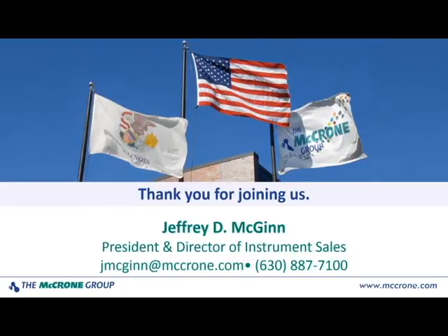From Kirk again, is the 5-day course only available with the purchase of the SEM system? No, it's not. You can take the 5-day course without the purchase. And Chuck, when's our next course scheduled for? Our next 5-day SEM course? Third week in October, I believe. October 24th through the 28th, I think. It is a very popular course. We do limit the number of seats so as to give people the most hands-on instrument time possible. So we try to keep the class small, but it's available to really anyone who's interested in learning about scanning electron microscopy.